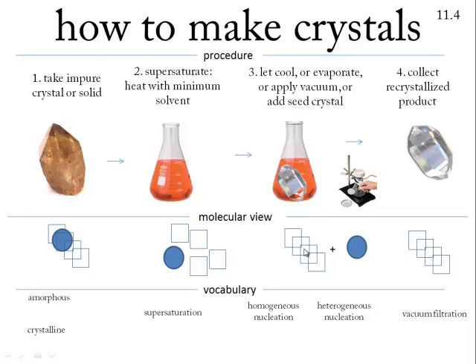These things tend to stack, and so as it stacks, it can remove, hopefully, those impurities, and that's the big principle behind it. It's a restacking process. Remove that stuff because it's dissolved, hopefully, and you have yourself a recrystallized material that can look extremely pure.